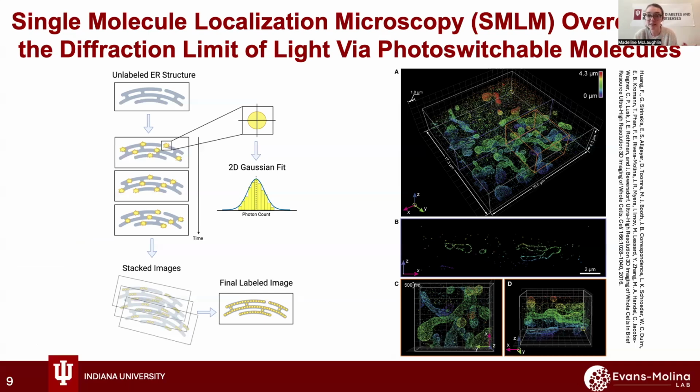So whereas previously single molecules very close together would be indistinguishable, because they are not all collected at the same time, but rather in cycles, all of those separate images, much like a Z-stack, can then be compiled into one image, and we can get single molecule resolution. And on the right is the ER labeled in COS7 cells in the Huang lab, applying the same technique.